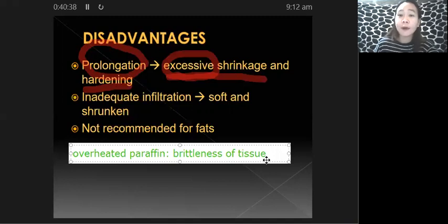All right. Remember, if you can still remember, I mentioned this in the post-laboratory discussion of activity 1. Okay? 'Di ba, what do we do after melting your paraffin wax? Okay? So especially if you are using your hot plate to melt your paraffin wax, we can use higher temperatures.